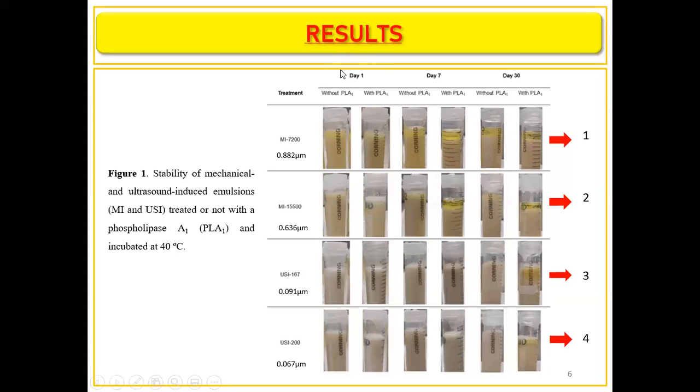For day 1, without the phospholipase, in the mechanically induced emulsions we see a yellow and opaque color, whereas the ultrasound induced emulsions have a milky opaque color.